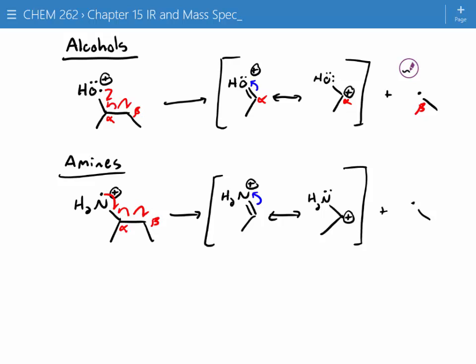So these carbocation fragments show up really, really well just simply because they're stabilized through resonance. So hyperconjugation and resonance, we've already seen these in terms of carbocation stability. We just haven't seen alpha cleavage in terms of mass spec or using radical reactions. Does that make sense? So you have two beta carbons there. Yeah, in this case, I just chose one of them. You could have fragmented either of those. Yep. That's a good question.